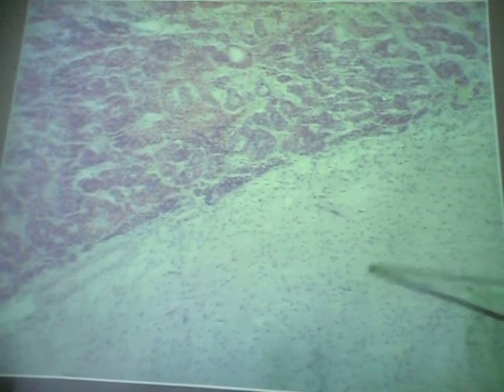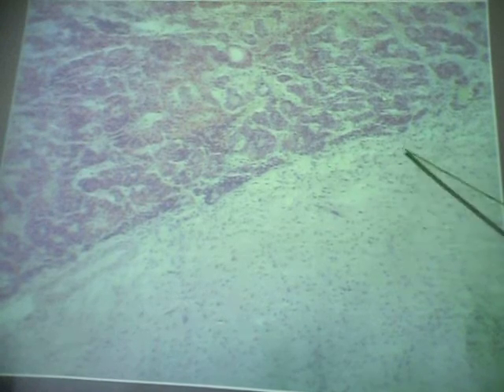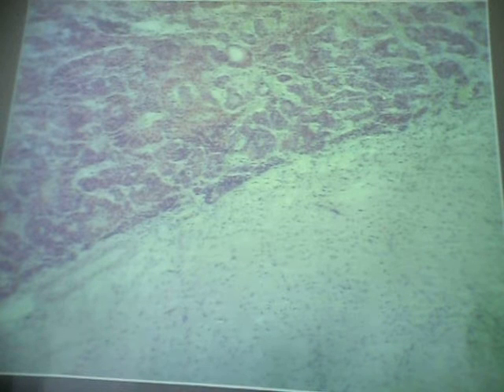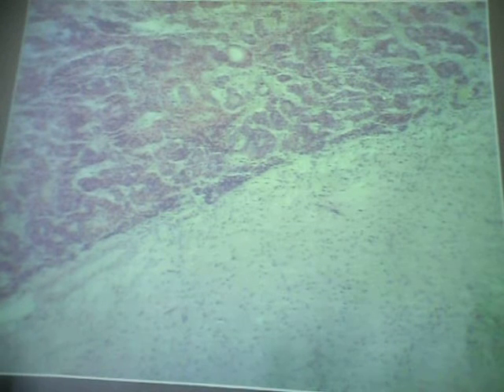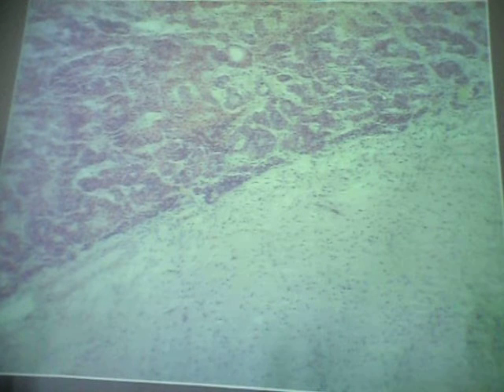We're first going to look at the posterior pituitary. Now, most of the cells you see here, and all these little nuclei you see here, are not those of neurons, but those of glial cells. In A&P1, I'm sure you talked about neuroglia or glial cells. You probably know there are 6 different types, 4 of which are confined to the central nervous system, brain and spinal cord.